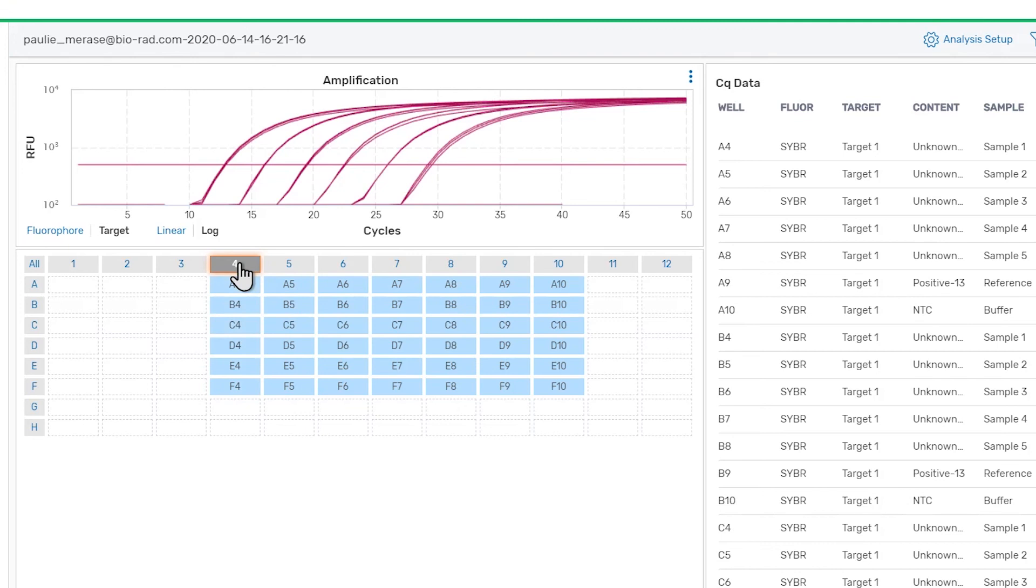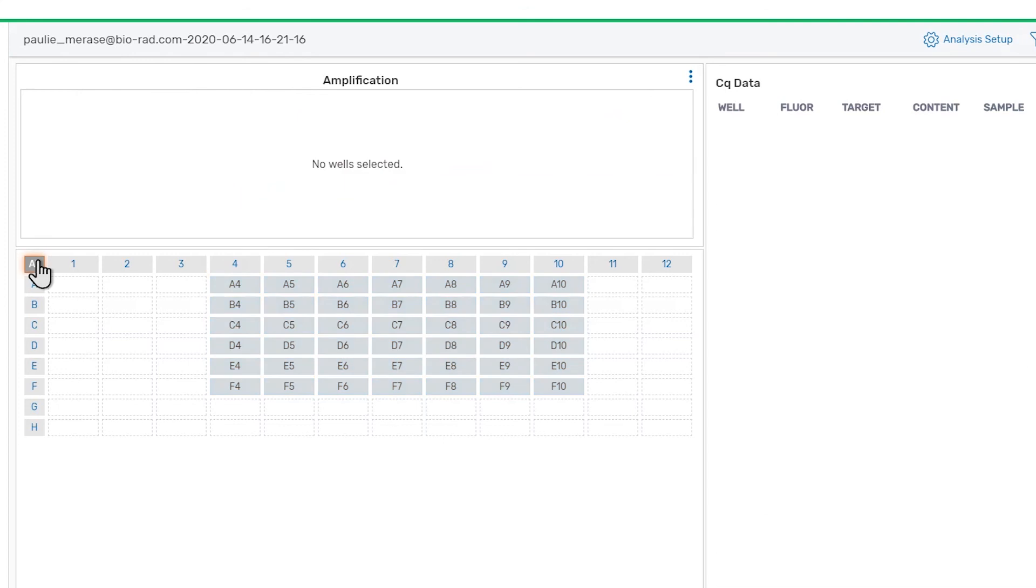It's important to note that only visible wells will be included in the exported data. Let's turn off the visibility of all wells on the plate by clicking the All button in the upper left corner of the well selector. Then we'll select the first set of replicate wells and review the data.